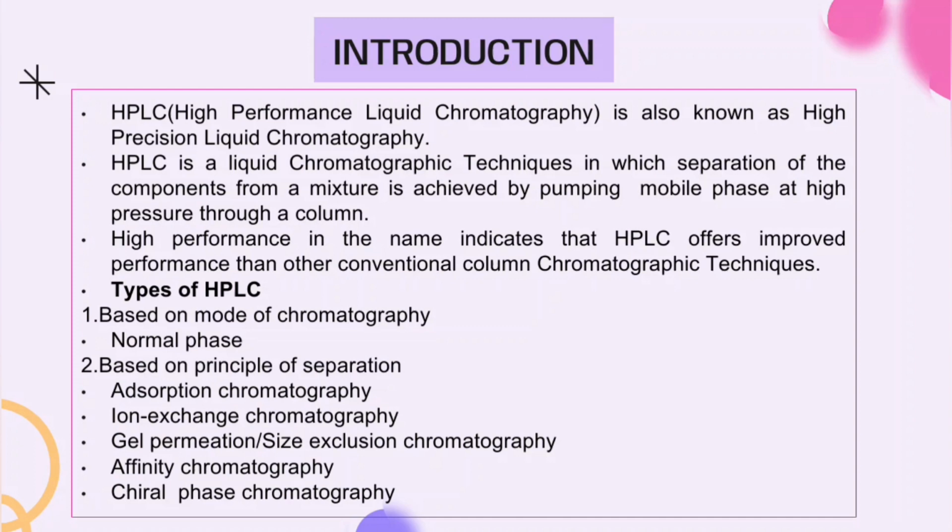Then based on principle of separation: adsorption chromatography, ion exchange chromatography, gel permeation or size exclusion chromatography, affinity chromatography and chiral phase chromatography.